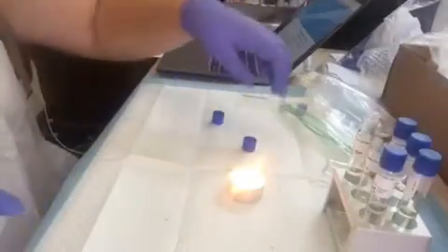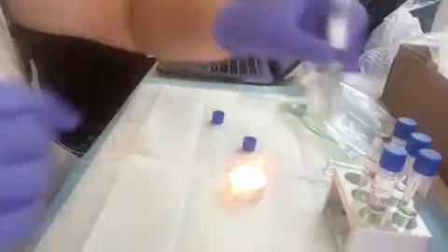So 1, 2. Just going to flame the lip one more time.